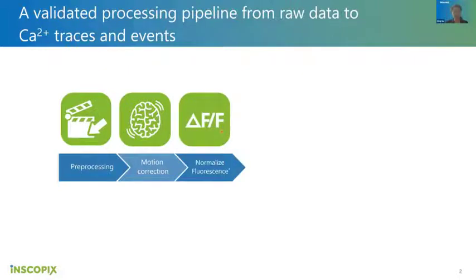And then we have the delta F over F conversion just to detect the dynamic signal instead of the static signal. This step is required for one of the algorithms to detect cells, which is PCA-ICA. But for CNMF-E, since its way of handling noise is different, all of those backgrounds need to be preserved. So this step will be skipped.